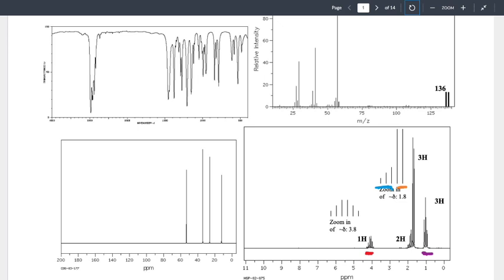Instrument sees this hydrogen. Is this hydrogen unique from this one? Nope. So where does it show up? It's just lost. Ta-da, another hydrogen. Sees this one. Where does it show up? It sees this one. Goes in the same spot because it's not a unique carbon. Internal mirror plane, these hydrogens are identical to those hydrogens, which means it's also going to show up in the same spot. So we got 1, 2, 3, 4, 5, 6, right?